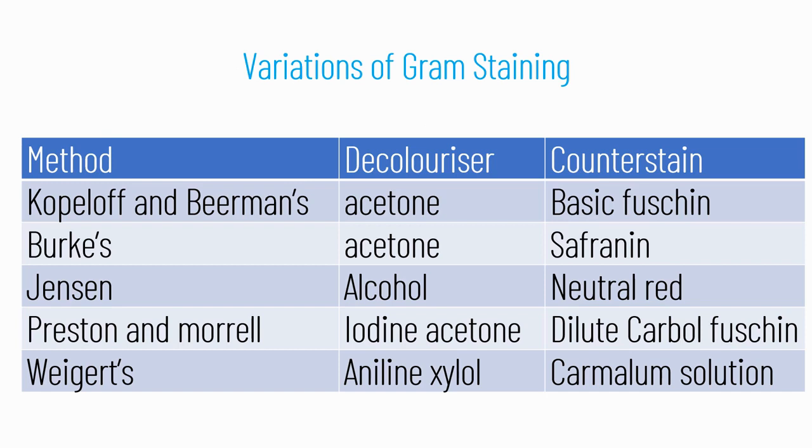Now there are certain variations of gram staining. Variation in the decolorizer used and the secondary dye, or even the variation in the time of application of these reagents, can give rise to modified forms of gram staining. Some modifications of gram stain are shown in this slide.